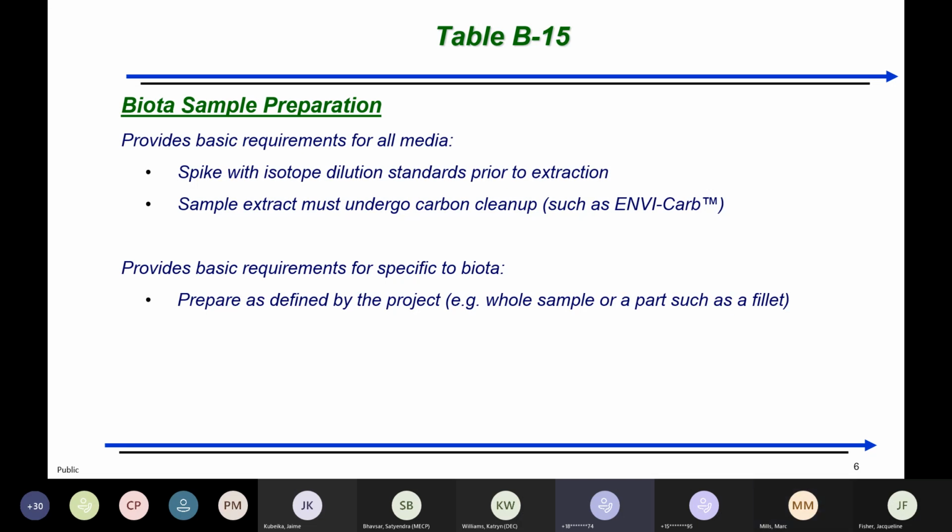We have limited information for aqueous and solid samples as well. Why are we okay with analyzing those and not really tissue analysis right now with the DoD? The reason is there's much greater variability in the biota sample results versus other media results due to the diverse processes laboratories use for preparing these samples. That's really the crux of it. This is not the case for aqueous and solid samples, as laboratories are fairly consistent in their preparation techniques, exhibiting very minor variation. Next slide.